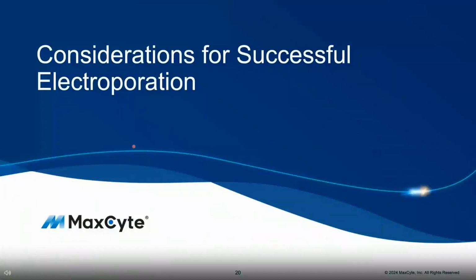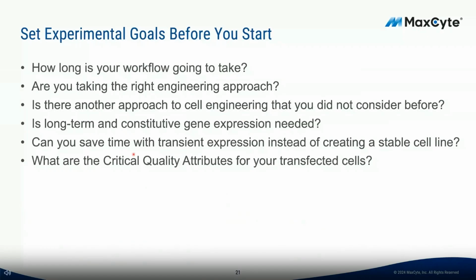And then I'd like to go over next considerations for successful electroporation. Okay, so next I'd like to go over how to set goals before you start. And you need to consider how long your workflow is going to take, not just the transfection portion, but all the way to achieving those final results.